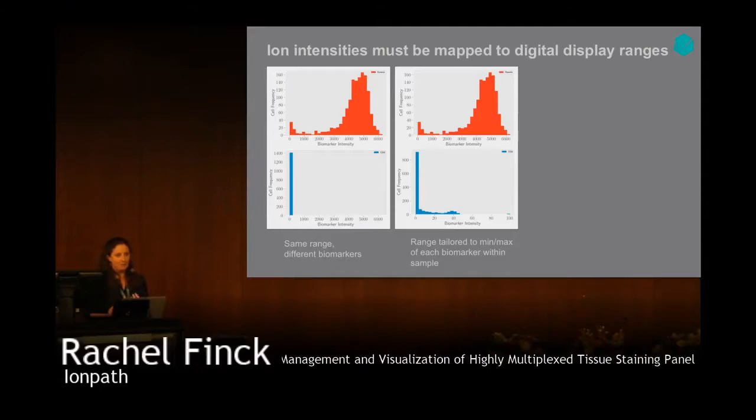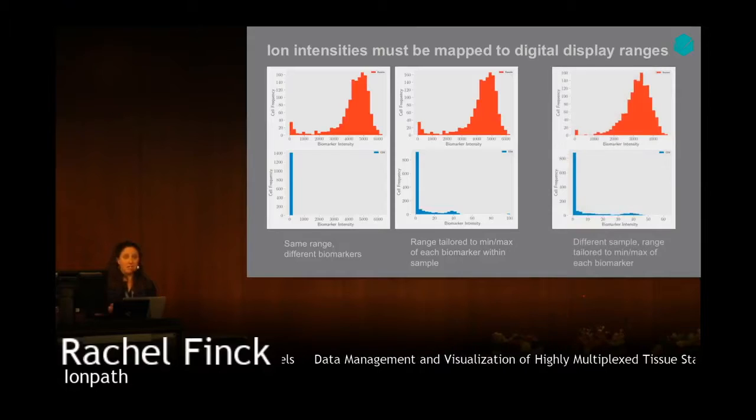And it's the same with imaging data, whether it's optical imaging or mass spec imaging, where you want to have that flexibility of setting the transformation. Here I'm just changing the boundaries, but I could have been putting it on a log scale, for example. That flexibility of setting the transformation and the scale that is right for your data set, but also being able to hold that constant and do quantitative or even visually consistent comparisons across data sets.